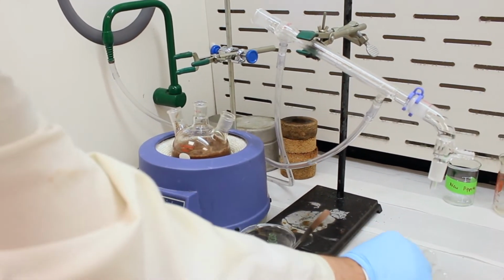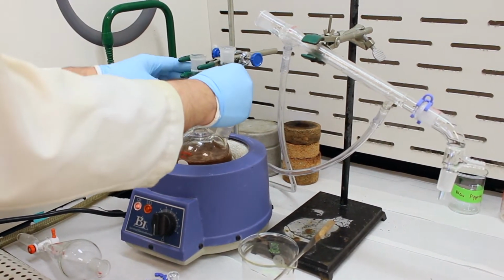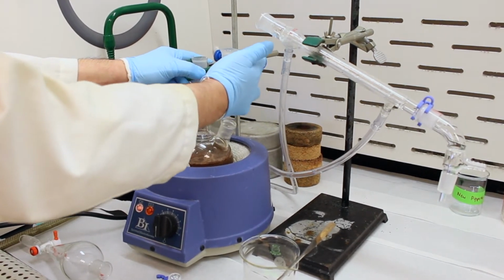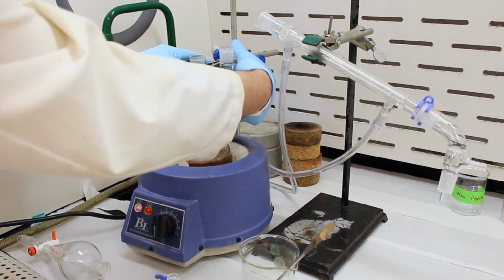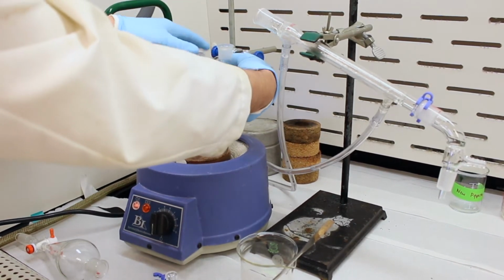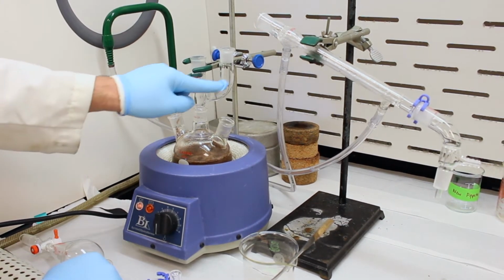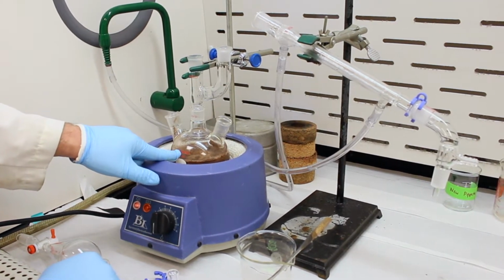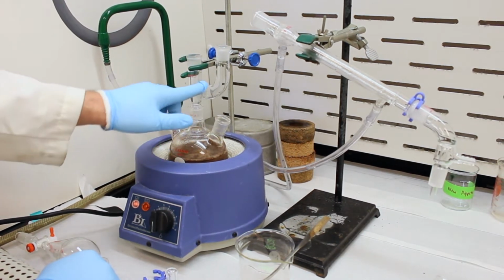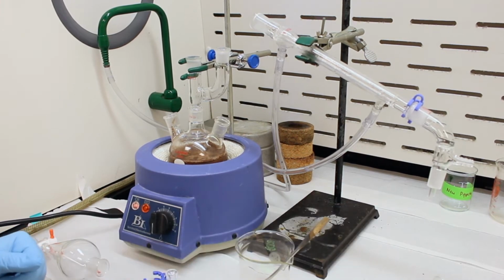Then on top of that, we'll put a Claisen head. So normally this piece of glass is used to put basically 2 necks on a single neck flask. Because this is a 3-neck flask, it's not really needed for that purpose. But the purpose of this is to basically increase the head space because this mixture likes to foam. So if it does foam, this gives us a little bit of breathing room so the foam will not slide over into the condenser and down into our distillate.